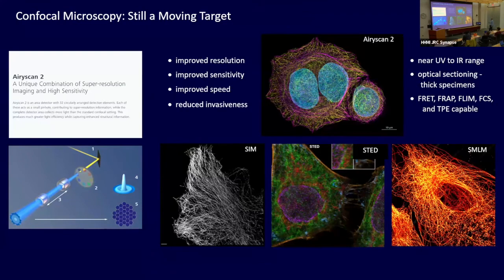I can do single molecule localization microscopy and spend months figuring out how to label this thing at high enough density and high enough specificity to see the thing I want. Or I can get that Airyscan right off the shelf, and I can immediately get images that look like this. Now, for most biologists, if they're not diving right down into the nanoscale, there really isn't any difference to them in terms of utility of this versus this, because this is nearly SIM already. It's pretty good. And it's faster because now they have a sensitive detector with multiple elements. They're not filtering through a tiny pinhole anymore.